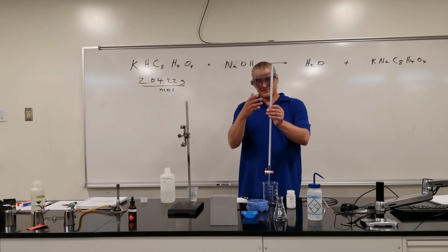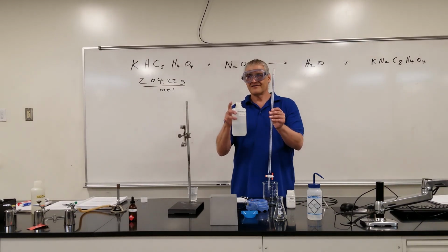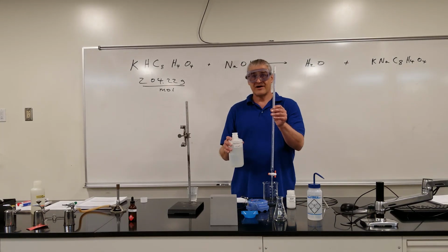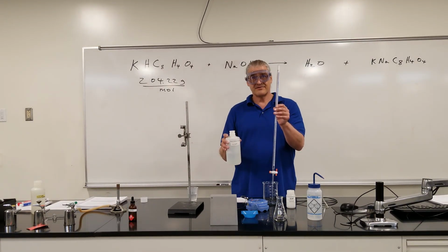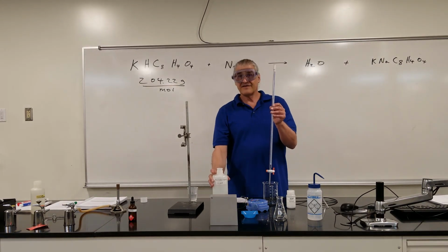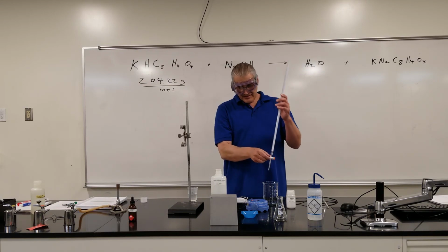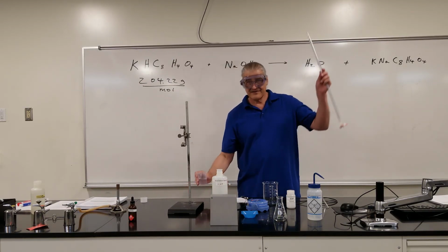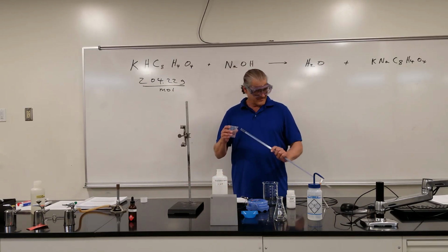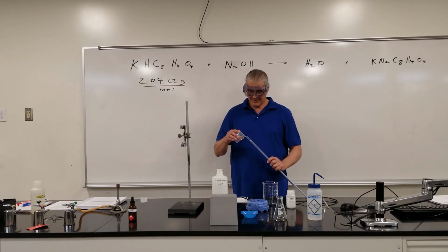That way you assure that the only thing in the burette is this. So if some previous student left a few drops of water in there, that's not affecting your experiment. You rinse it out with the stuff you're filling it with, and again, that's referred to as conditioning the burette. So we'll pretend I've done that 3 times. To fill it, again, make sure the burette is off, and you simply pour.